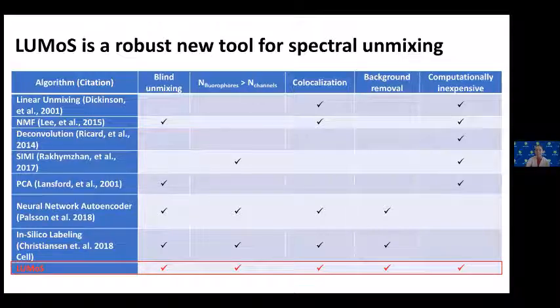And actually, a lot of our users started using the tool and pushed the hardware limit of my microscope. Some of my users were able to see 6 or 7 colors under a 2-photon microscope, which has very rarely been achieved before. Other people in other institutes also started using the tool and have given very good feedback. So that's a small story about one nice, easy way we used to deal with the hardware limitations of our fluorescence microscopy.